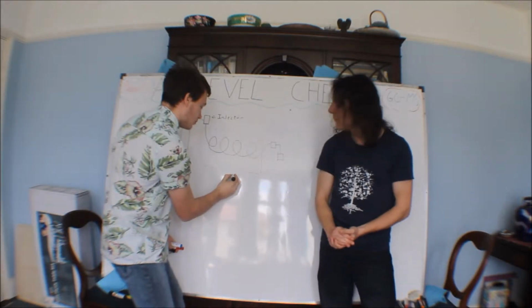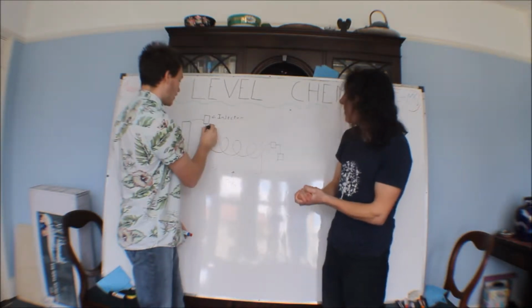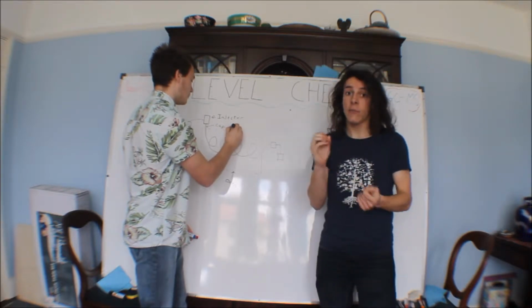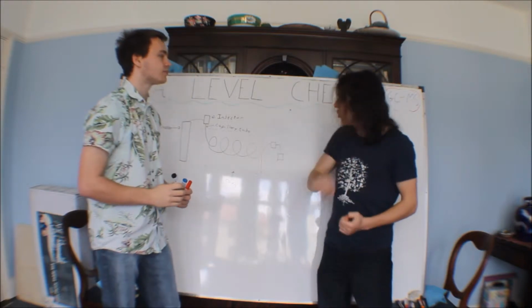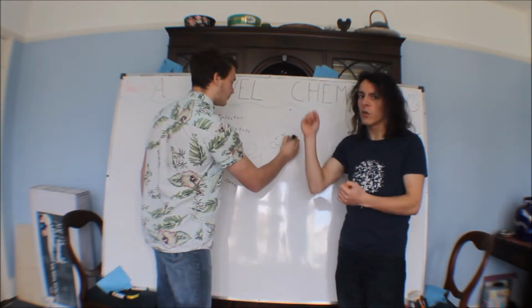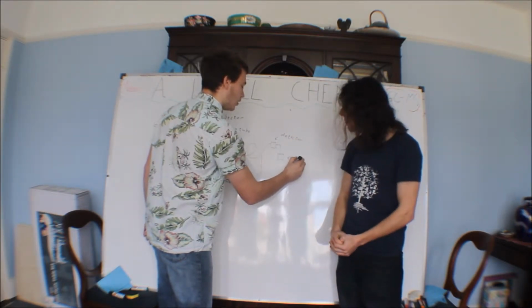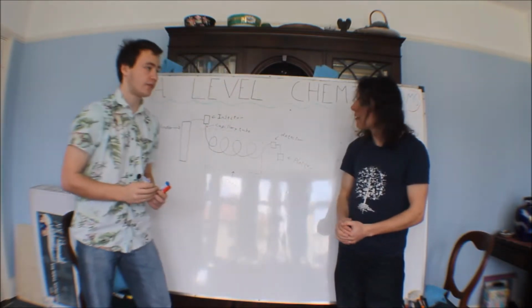That's good. So it has to be volatile because what we're going to do is heat it. Now, this red thing is an oven. That's why it's red, because it's hot. The wire is a capillary tube. We'll talk about that more in a minute. As it heats, it vaporizes our subject, which has a low boiling point, and then it travels through the tube, hitting our detector and a plotter, some sort of computer, and that tells us how long it took to go through the tube and what came through. It plots a graph, basically gives us a graph at the end.